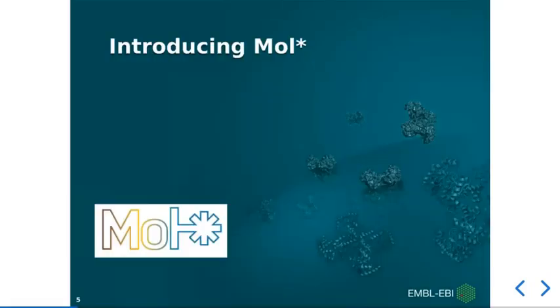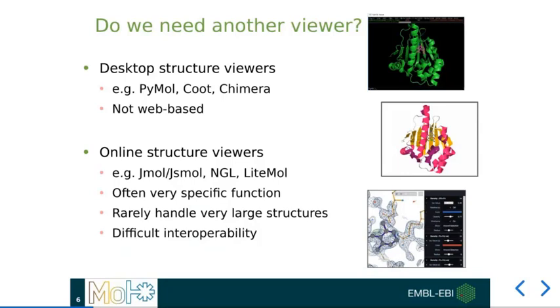So, to introduce Mol*, I'll assume all of you are at least familiar with the principle of molecular visualization and are probably aware of a few existing tools already. Perhaps the most well-known software programs are the desktop-based ones, such as PyMOL or Coot, that is, ones that are locally installed. Now, these often have powerful features such as elements of refinement or docking, but lack full web integration. On the other hand, there are a number of web-based tools such as JSmol or NGL, and whilst these can be embedded online, they often have very specific functionality, and without the power of local hardware, they can struggle to display larger structures and volume data.